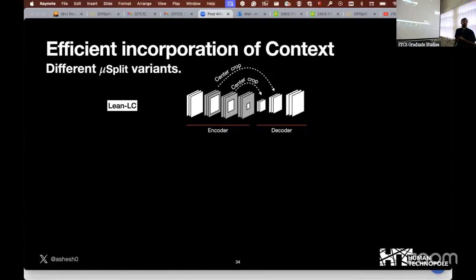So this autoencoder is already trained or you train it? We train it, yes. So the input is an image, is it a slice or a stack? At this point, it is a slice. A 2D image, yes. Okay, right. And it is basically, let's assume, 2 different structures stained with the same dye. Yes. Or 2 fluorophores, but you have both of them turned on simultaneously. Yes.